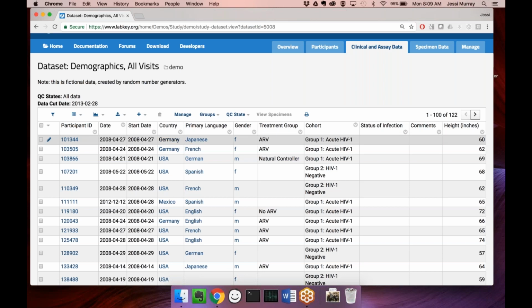But this buys us a lot of space back in a button bar that was getting pretty big. We've also updated this paging tool. So now if you want to adjust the number of rows per page or do navigation to first or last, it's all in here.